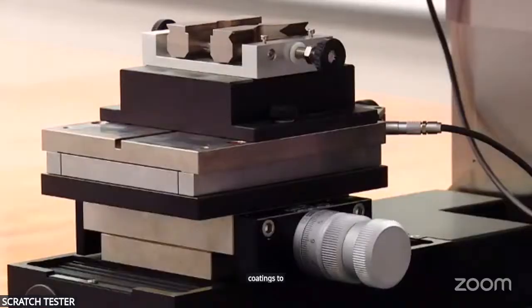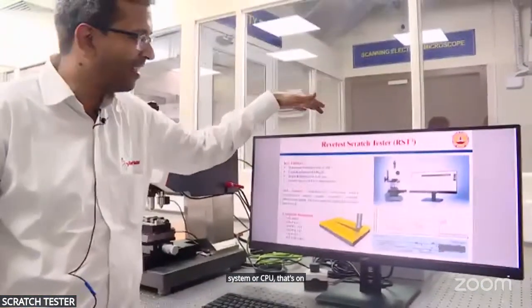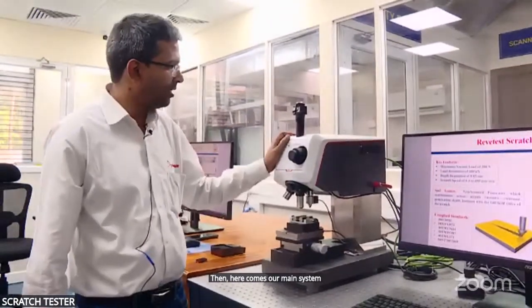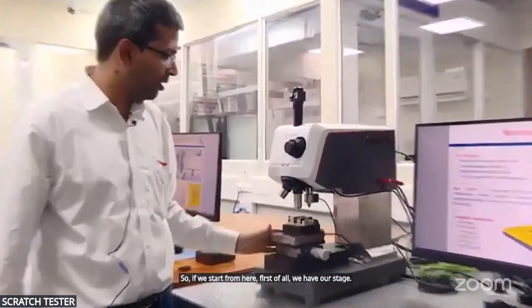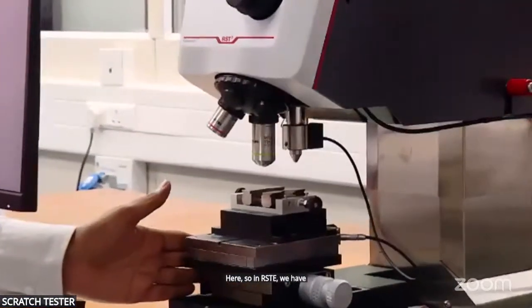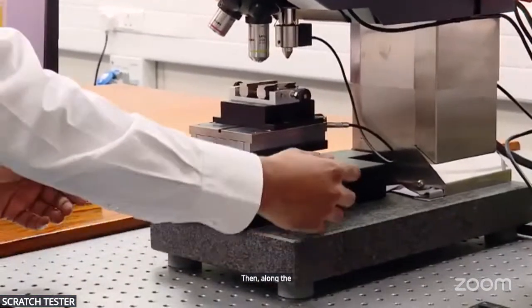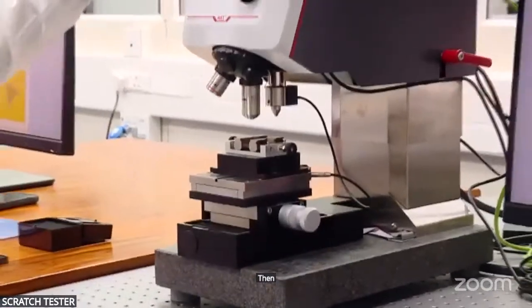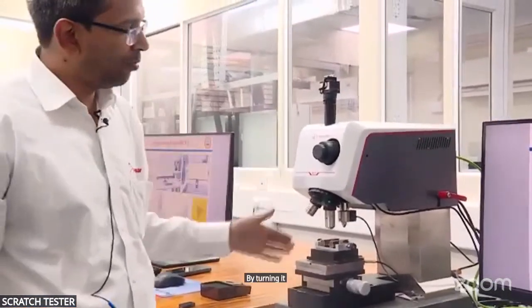Coming to the machine components, we will start from the right. First of all, we have our acquisition system or CPU on the back side. I think we cannot see it because of the monitor in front. Then here comes our main system, RST. First of all, we have our stage here. In RST, we have one movement which is software controlled, along this axis. Then along the x-axis, we have manual controls to move the stage right and left. To move the head up and down, we have knurled screws on the side. By turning them, we can move our head up and down.